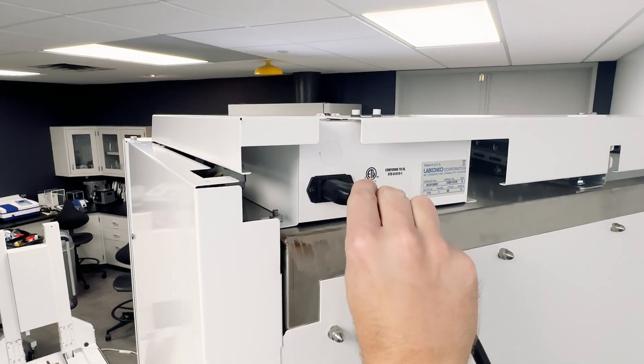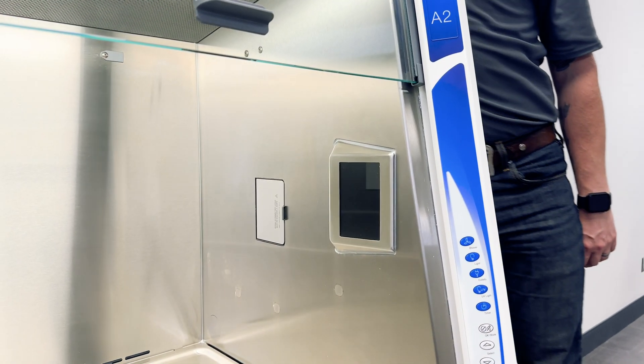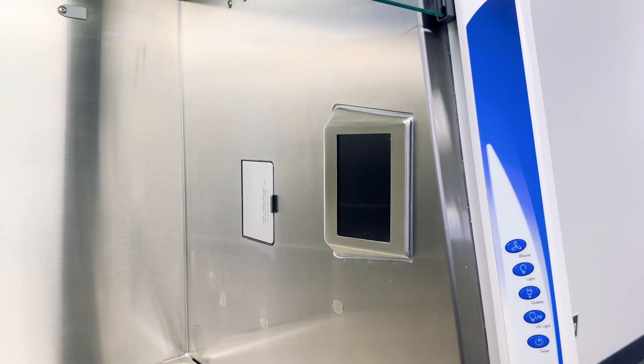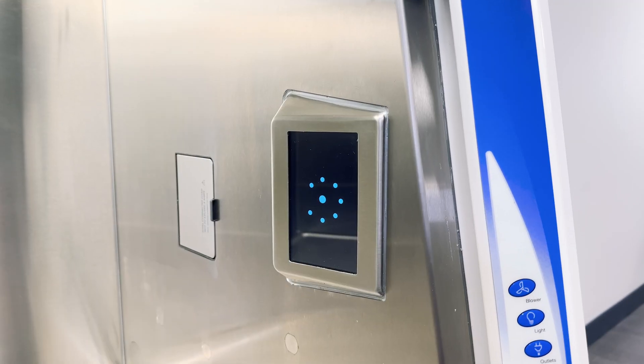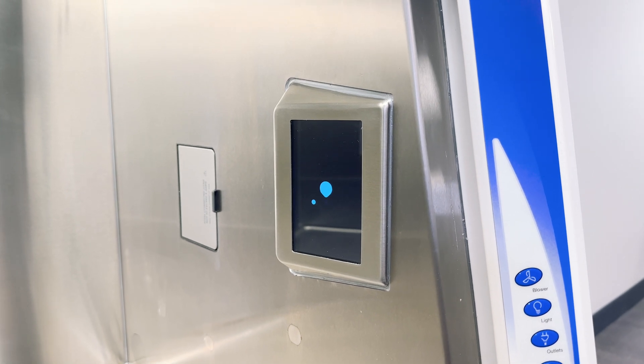Next, connect power to the cabinet and turn the cabinet on to test functionality. The cabinet's operating system will take about 20 to 30 seconds to start. After it comes online, check functionality of the sash, lights, and blower.